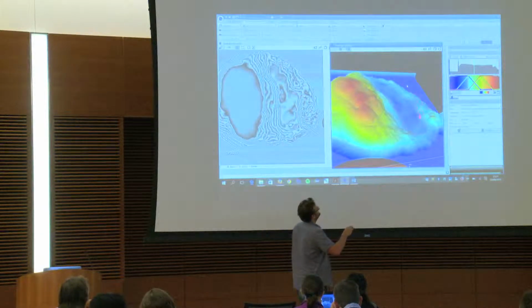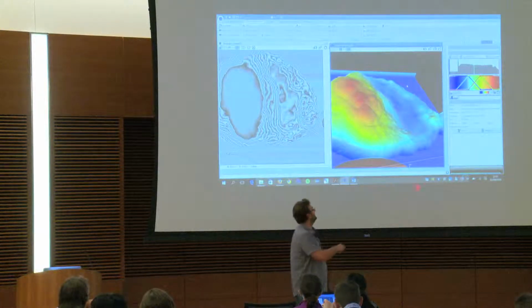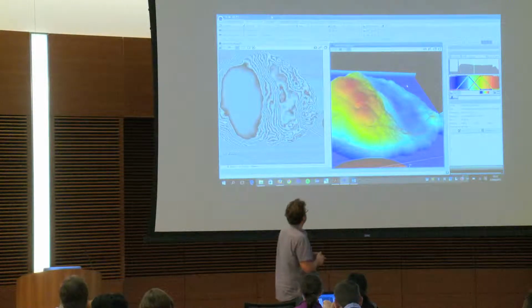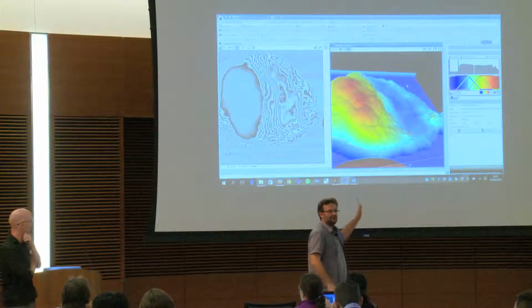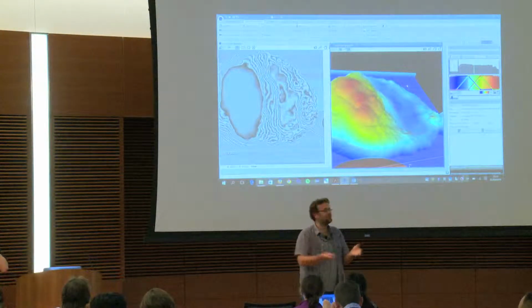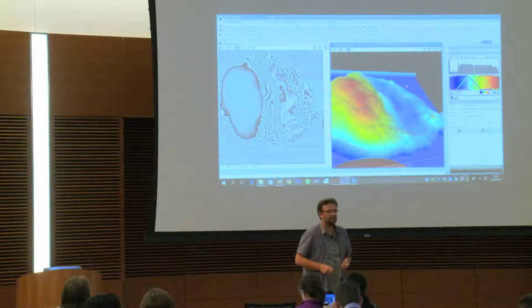And there's a second thing that is cool with this, but I don't remember. Oh yeah, you know the angle of the probe. The very big problem is that in our question here, we want to measure the density, the number of the knobs, those little things that we have in the sample.